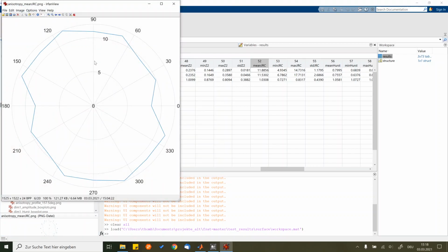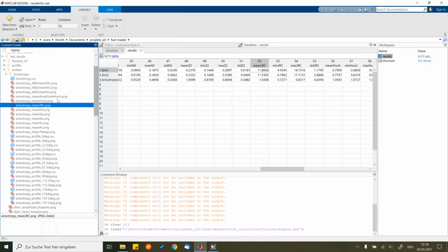So we have this slide, right? Make sure here you're comparing this direction, so the horizontal, and so the vertical to the horizontal. So we see, yes, the mean value in the horizontal is a little bit lower than in the vertical direction. But also remember, this one is not mean values, but based on one single profile, so directly the one in the middle of each direction. Right? So this supports you in this anisotropic analysis.